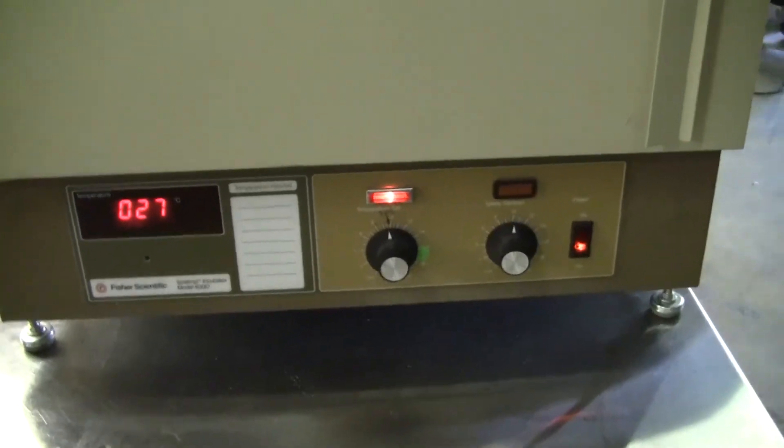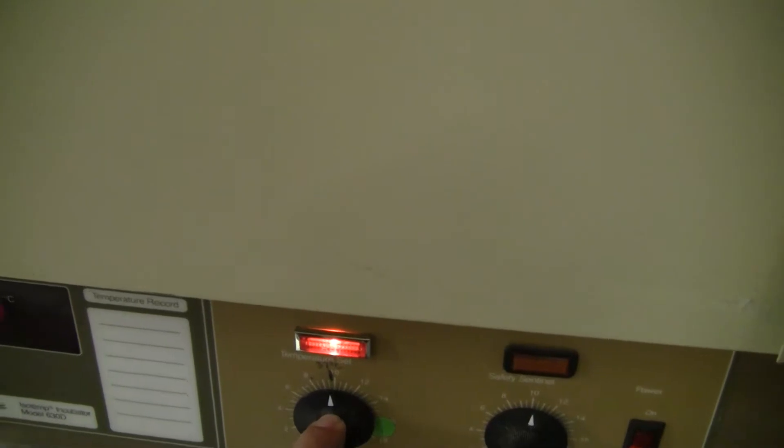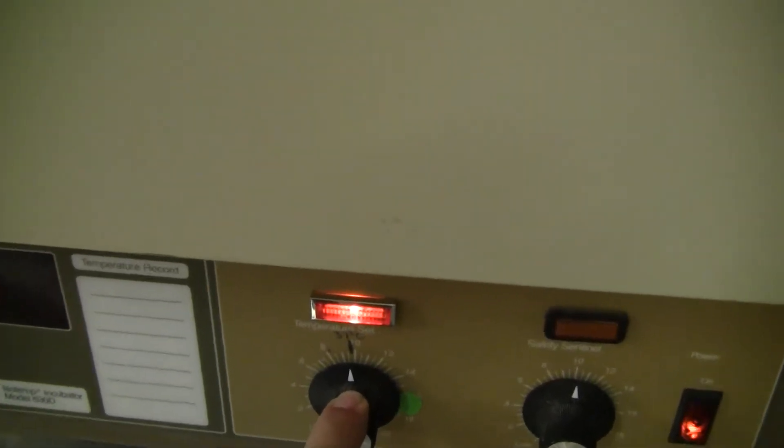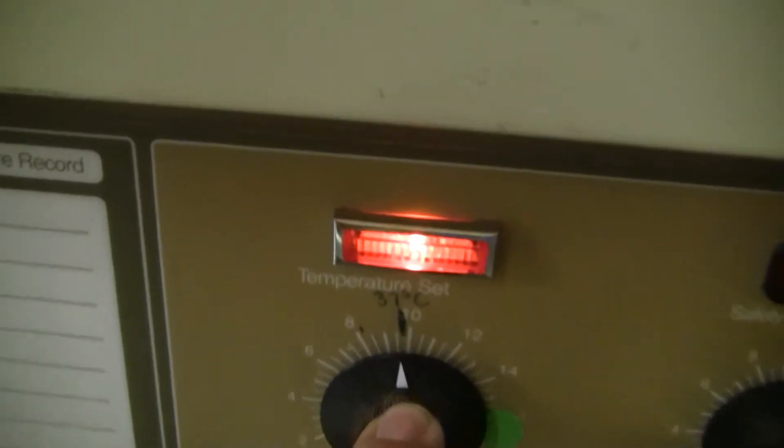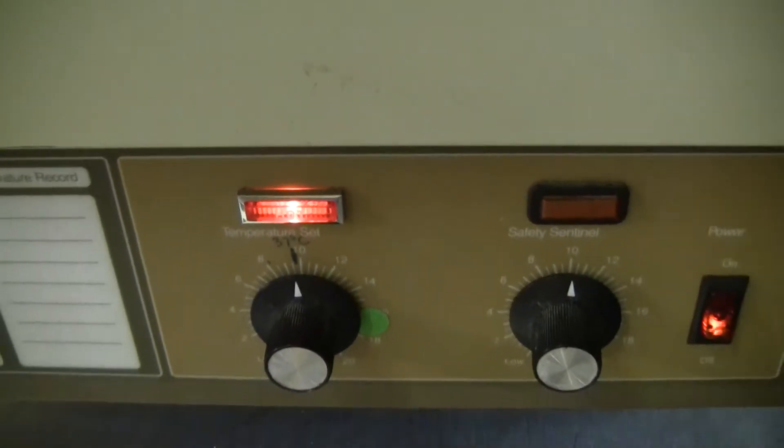Very simple controls. As you can see it's heating up. We have it set to approximately 35 degrees C. Somebody has marked that on the dial. It has to be independently verified of course.